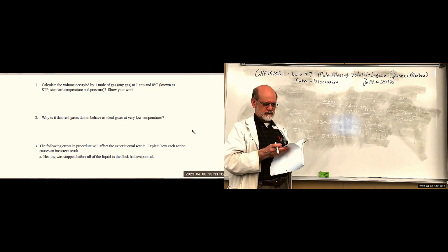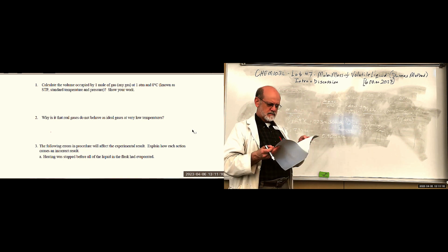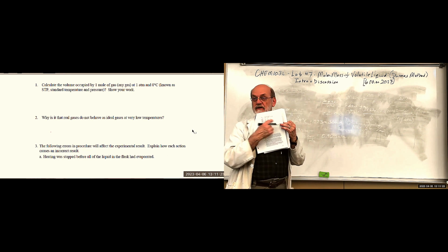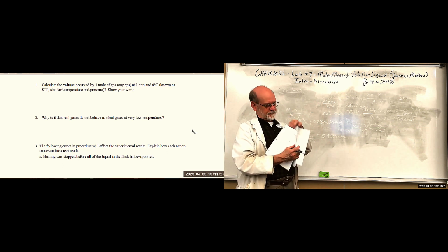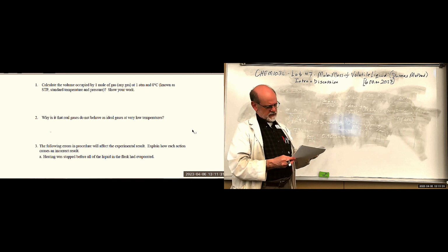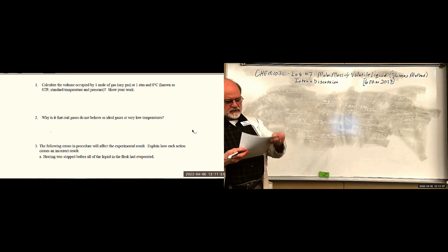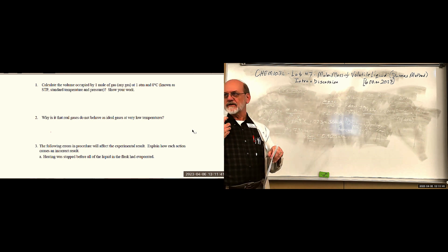And so we look over to page 3, I think it is. No, page 5. Then you take that value that you get and look here and see which one it is. That's it, isn't it? Yeah. So all you have to do after that is show me your data, calculations, and tell me what gas it is.